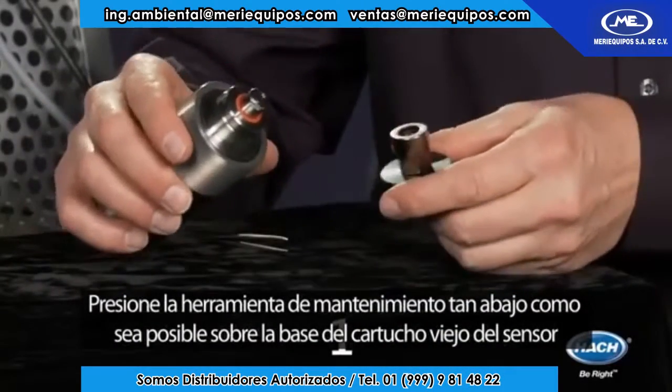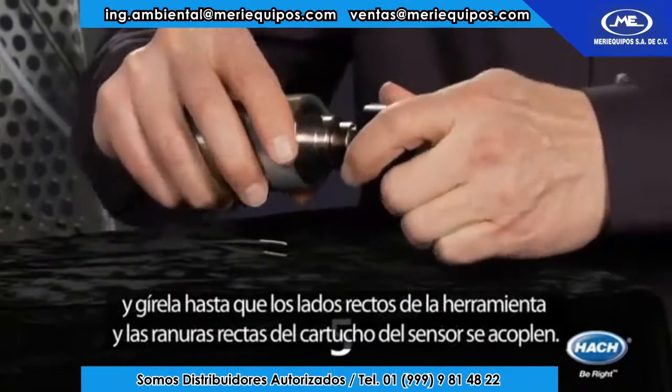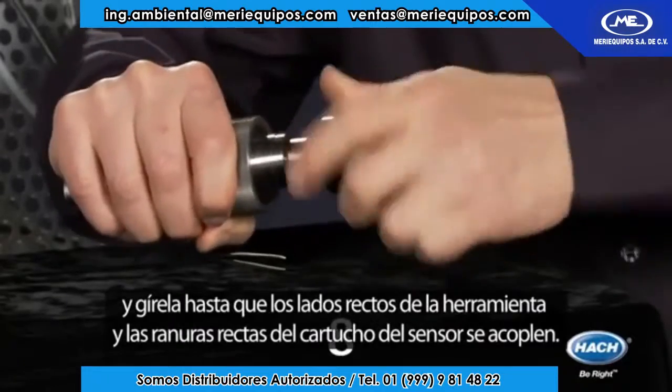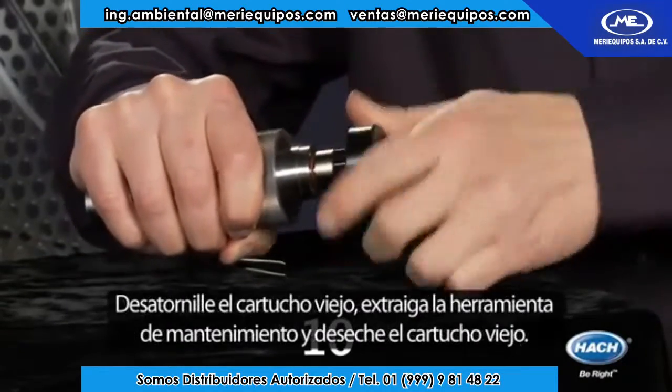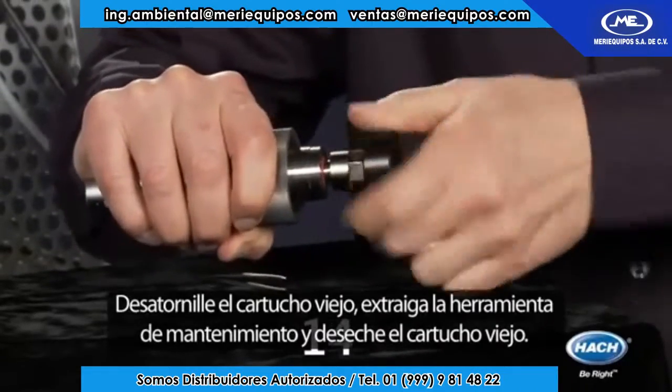Push the maintenance tool as far down as possible over the old sensor spot and twist until the square side of the tool and the square slot of the sensor spot engage. Unscrew the old sensor spot, pull out the maintenance tool, and discard the old sensor spot.